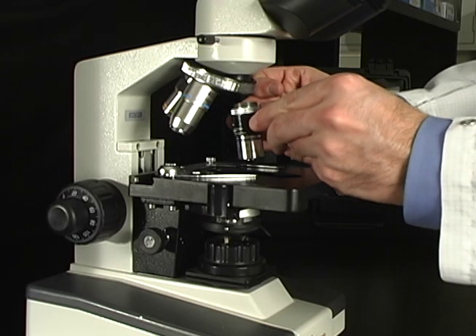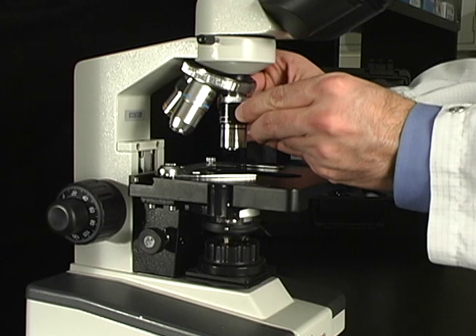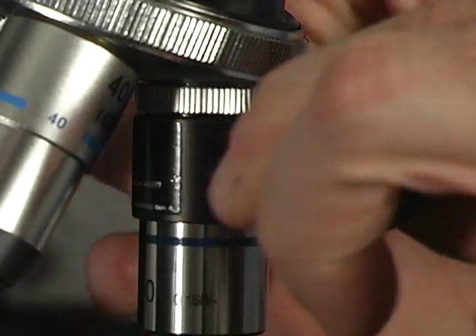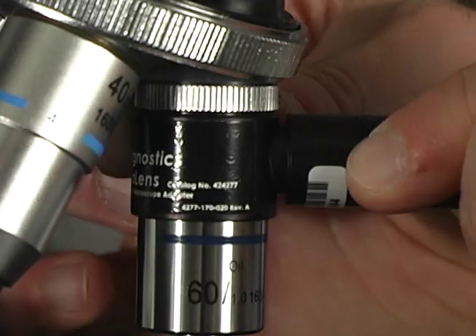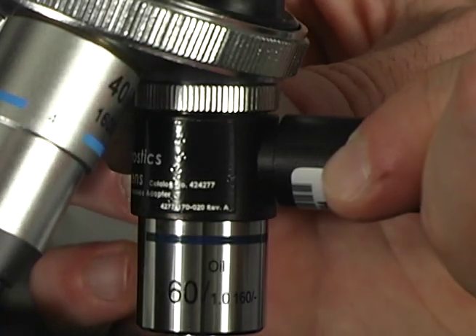To attach the Paralens body objective assembly, first thread the objective and body assembly directly onto the microscope nosepiece. Twist until the attachment is tight and secure. Be careful not to force the Paralens into the threading when attaching, as this could potentially damage both the Paralens and the microscope itself.